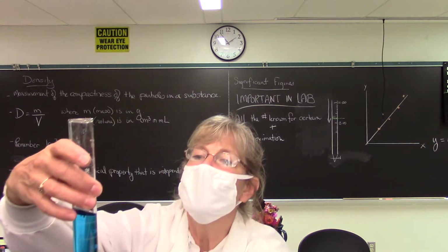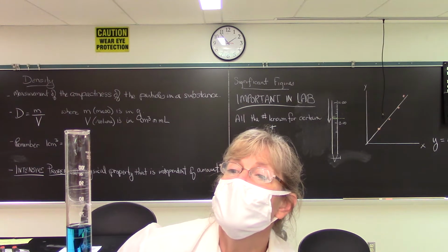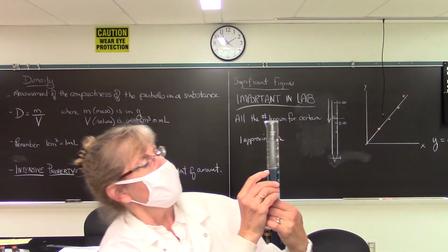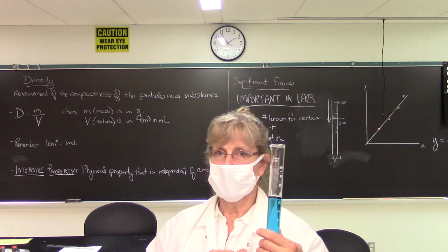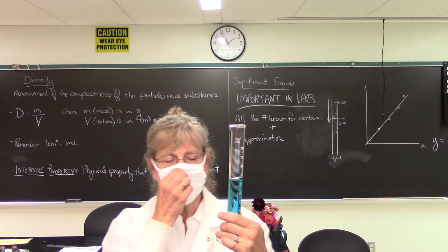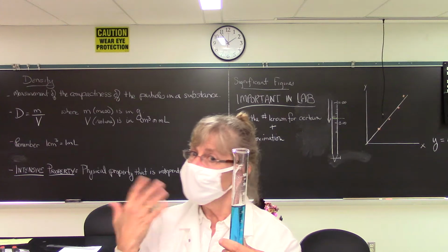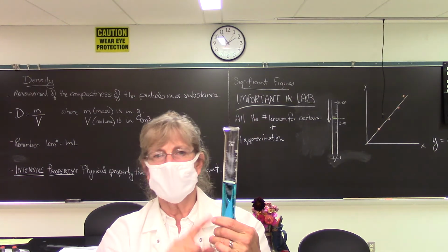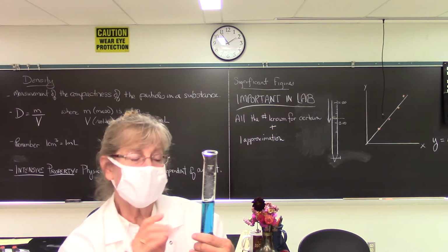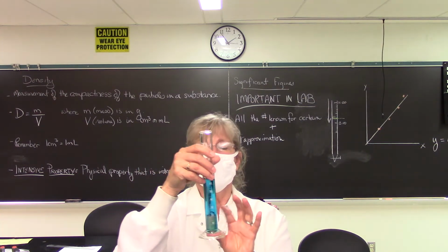Now, I'm going to take a reading, and you can't see it, but I can. This is now 65.2 milliliters. Again, 65, and the meniscus is just above that, so 65.2 milliliters. So now the volume of the slug is the difference between the two, right? I didn't add any more water. I didn't lose any water. I slid it down in. The difference in the volume is due to the slug. That's how you find the volume of an awkward object like a rock by volume displacement.